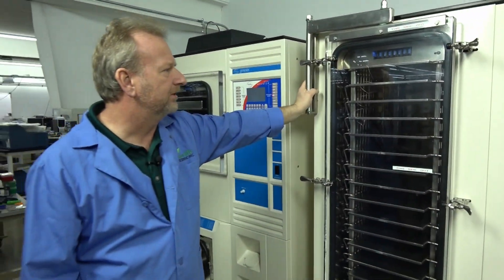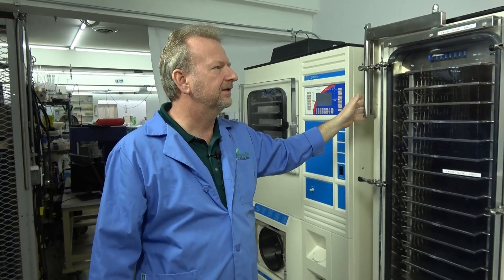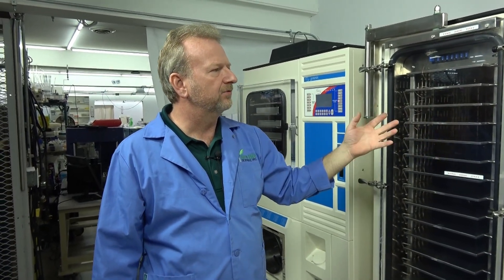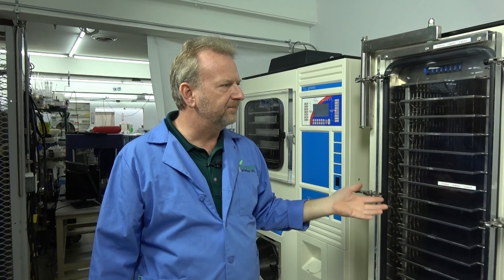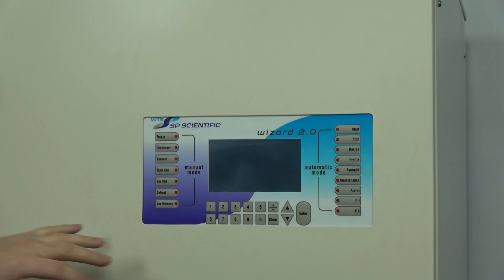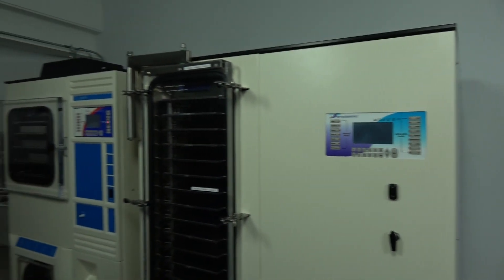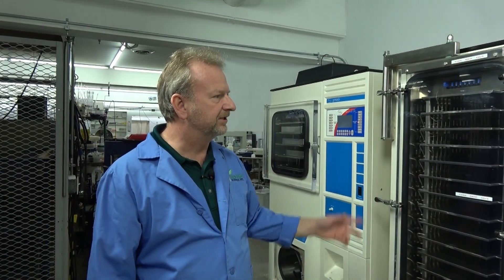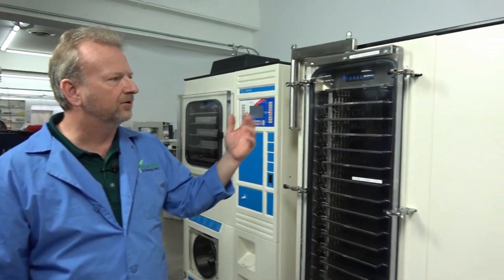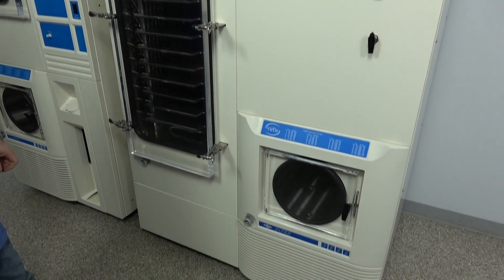This is the unit that steps up to about the end of lab use before going into full production. This particular Ultra is one we converted and upgraded to the Wizard 2.0 control panel — it was previously run by the older PLC units that Virtus has discontinued, and we've completely refurbished it and updated the whole control panel, going through the refrigeration as well.